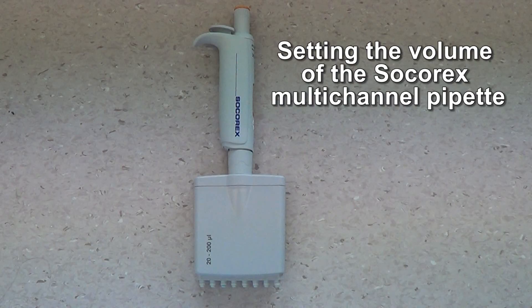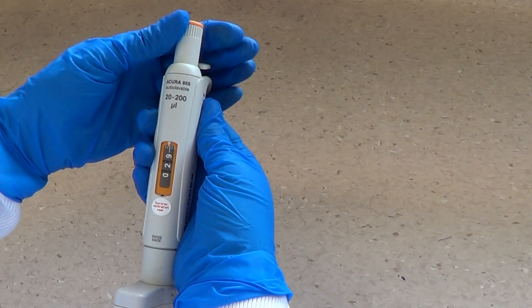Setting the volume of the Socorex multi-channel pipette. Adjust the volume by turning the plunger.